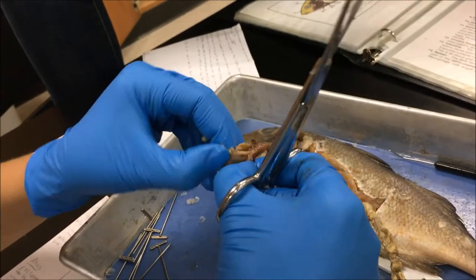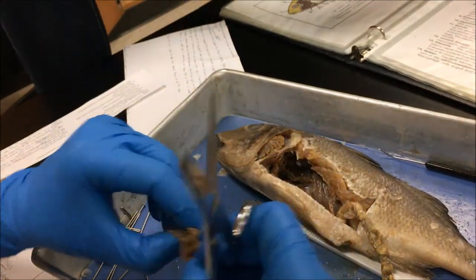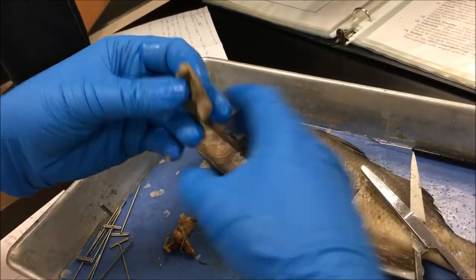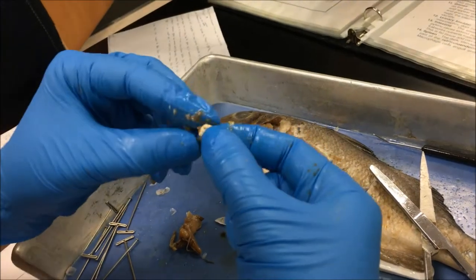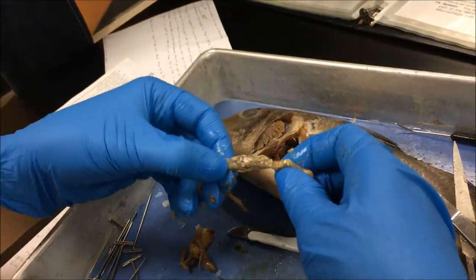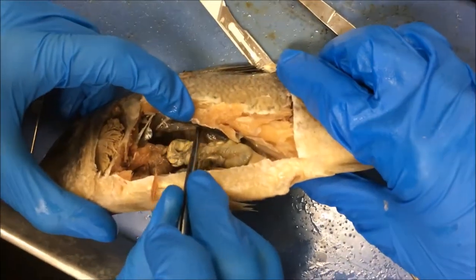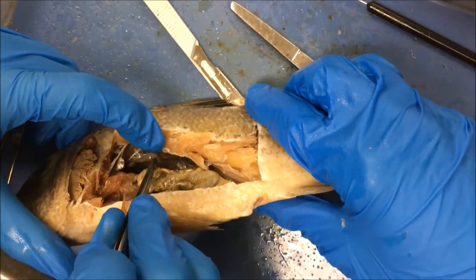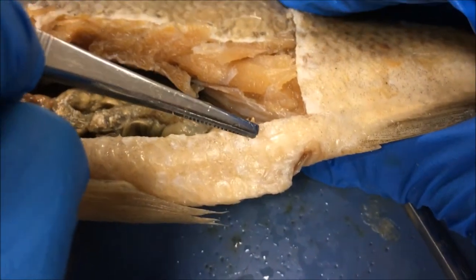We're opening the stomach now to see what's inside — it looks completely empty, so it hasn't had a meal in a while. Looking in the intestine, there's a little shell — it's a mollusk. There are lots of shells here too, so it only ate mollusks. The kidney is the dark region that runs alongside the spinal cord. It removes nitrogenous waste and leads to the urinary bladder, which releases waste through the urogenital pore.